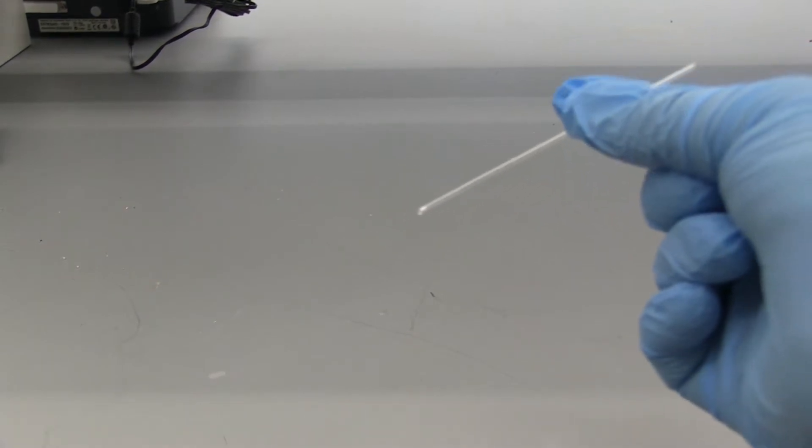Alright, so we have our unknown. It's a white, shiny powder. And now we're going to take this over to the melting point apparatus.